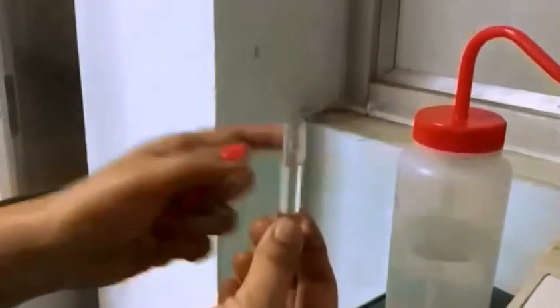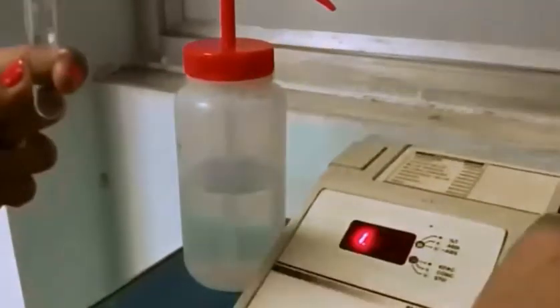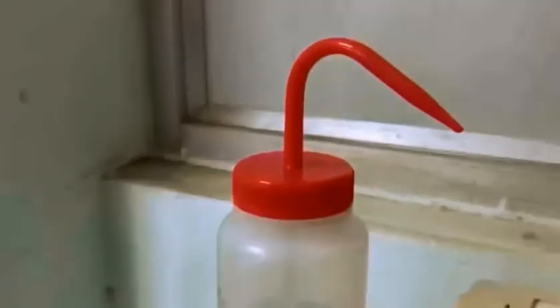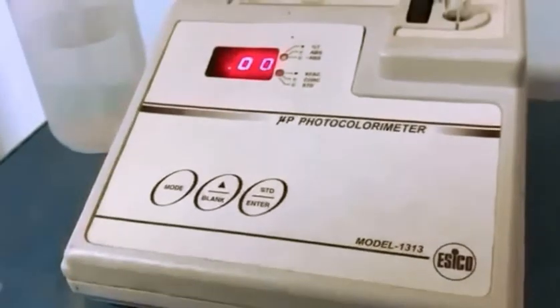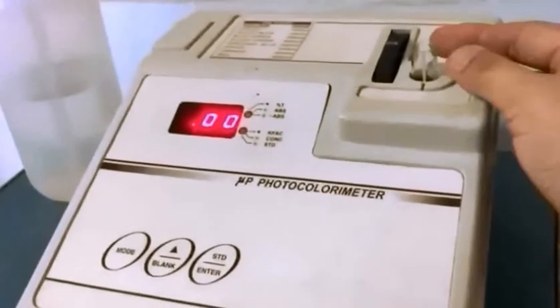In this cuvette, this is the distilled water I have taken, and then I'm going to fix the wavelength at 540. For this particular colorimeter it has 540, so I'm adjusting at 540. It has a white mark here, and this white mark should correspond with the knot in the colorimeter. After this I have to press blank for measuring the distilled water optical density. Yes, it is 0.00 I have set.